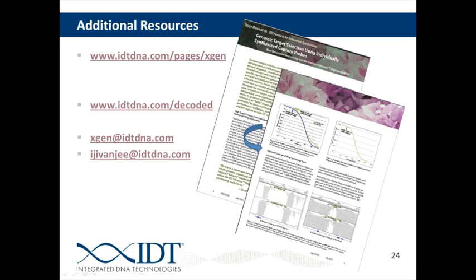Yeah, and I would agree with that as well. There's not a great way to determine what you need to supplement until you can see what deficiencies you have. Part of that can vary based on the actual conditions that you're using for the hybridization and for the enrichment. And part of it can also simply vary based on the cell line you're using, the DNA preps that you're getting from that cell line, and things like that. So there's a lot of variables that go into it, and I would agree with Ibrahim, and I would strongly encourage anyone to do a sequencing run first, see where their problem areas are, and then design enrichments from that.